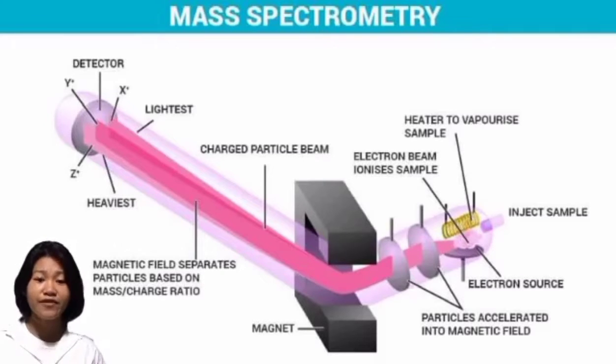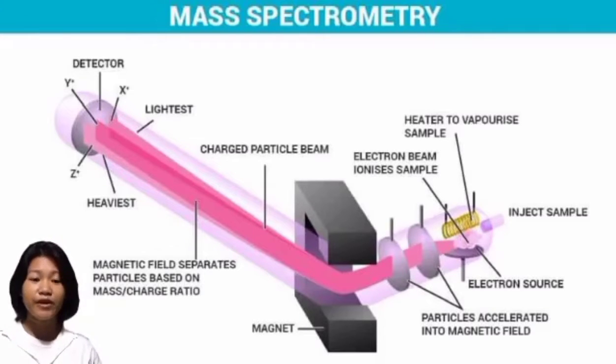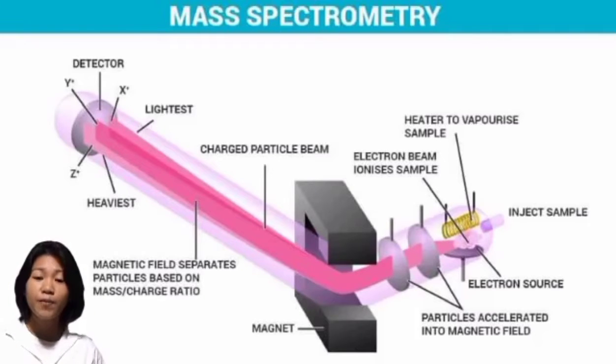These charged and deflected ions are now incident on a detector which is capable of distinguishing the charged particles falling on it. Based on the mass spectrum produced by the charged mass, one can identify the atoms or molecules constituting the sample by comparing them with known masses or through a characteristic fragmentation pattern.